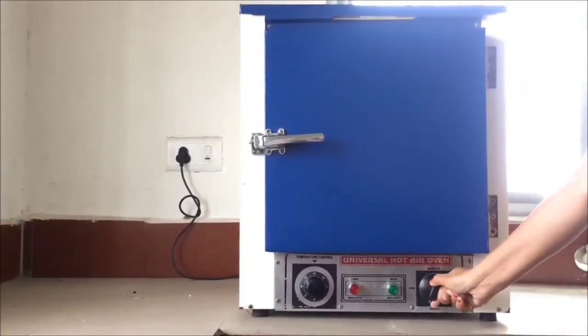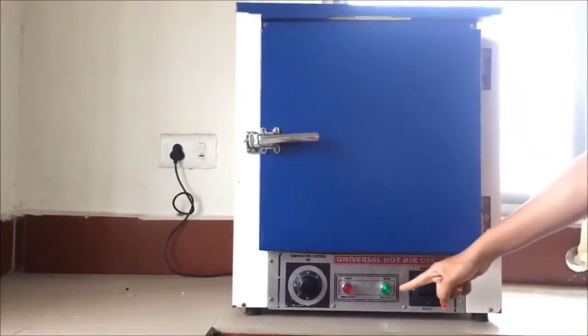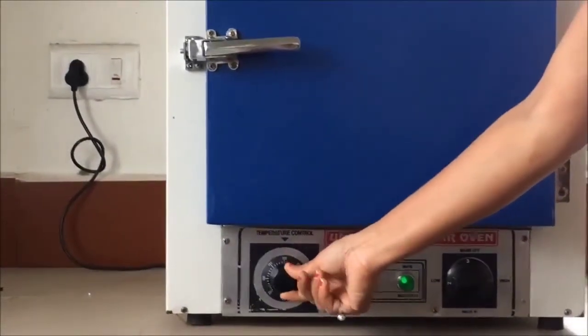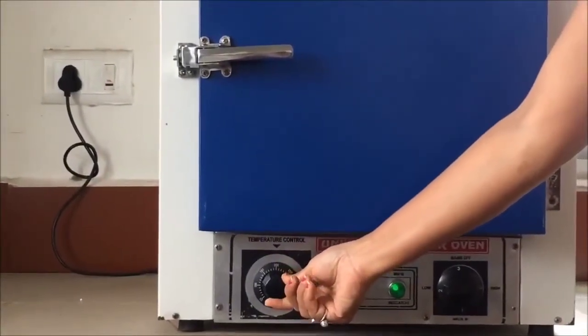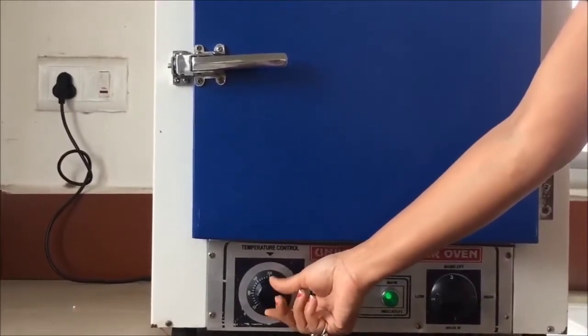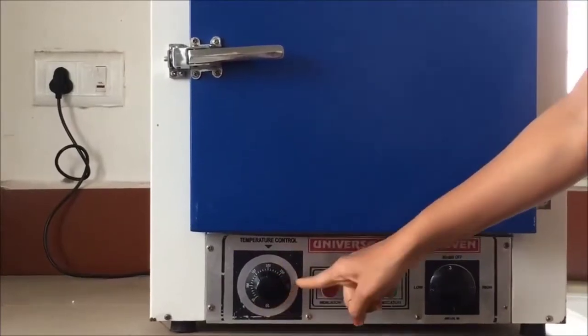This is the hot air oven. This is the on/off knob — if you turn it to the right, the light will come on, which means the hot air oven has been initiated. This is the temperature regulator, which regulates the temperature. If you turn the knob towards the right side, it will increase the temperature gradually.